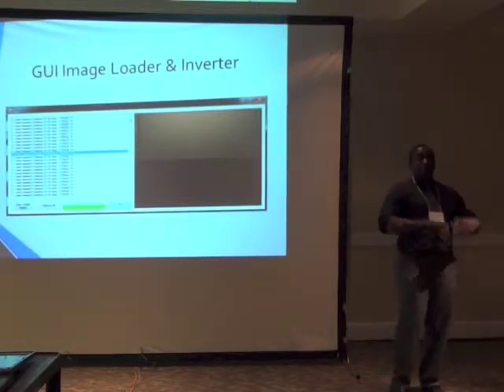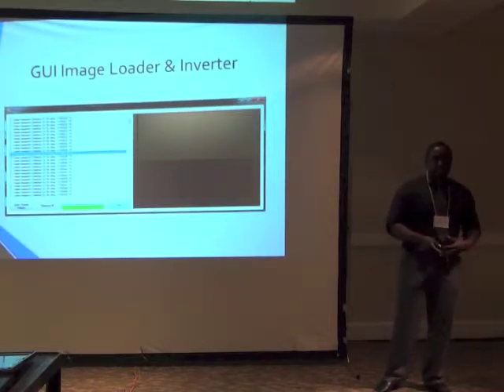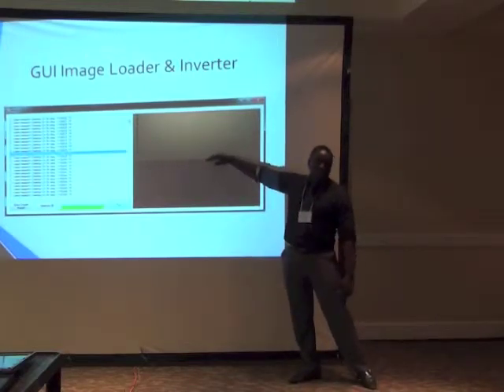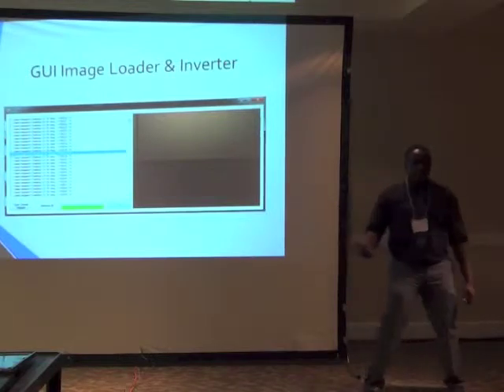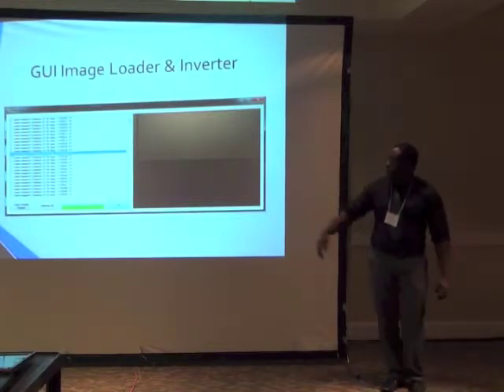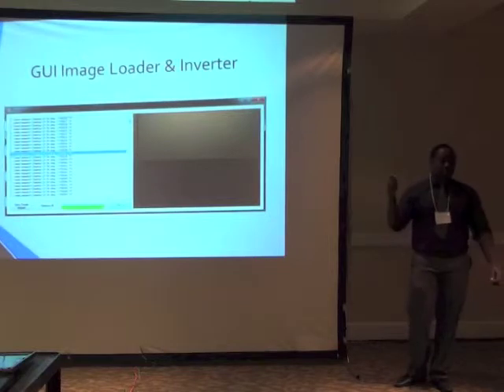in which you contain all the other images that were taken in that same session, because each session has different base images. As it processes, it simply runs through processing between here and here, converting that into binary, calculating the central calculations, then outputting into a CSV file. And that's how it runs. There's a little green bar showing you what to do. So you just come in, you've selected your droplet images, run, and it's as simple as that. It outputs to a CSV in the same folder.